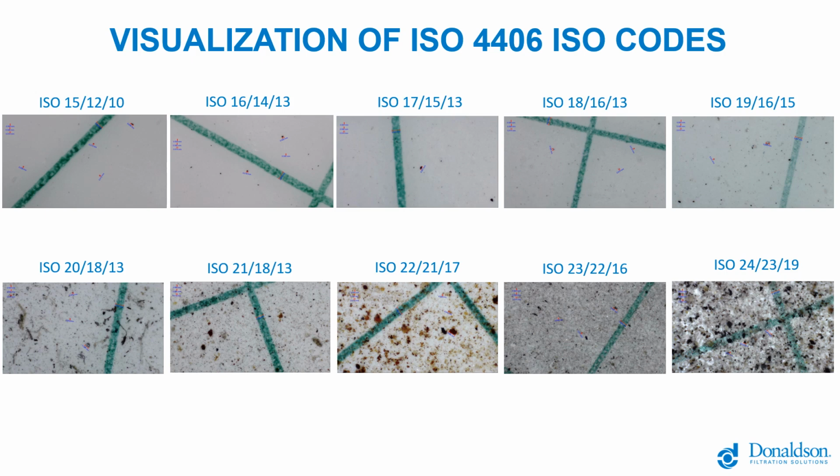Gearboxes are a little more tolerant of debris applications. 18/16/13 there, second from the right, is the target for those types of applications, but it is routine to see fluids much dirtier than that and contaminated with all sorts of things. You can see in the ISO 20/18/13 sample, there's a bunch of fibers in there. There's soft contaminants in some of these. In the ISO 22/21/17, there's some soft contaminants.